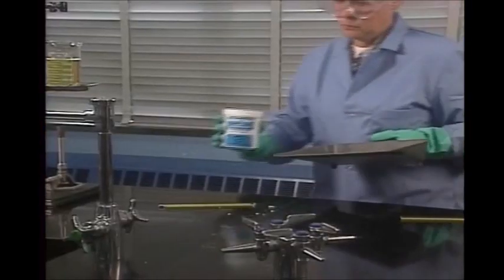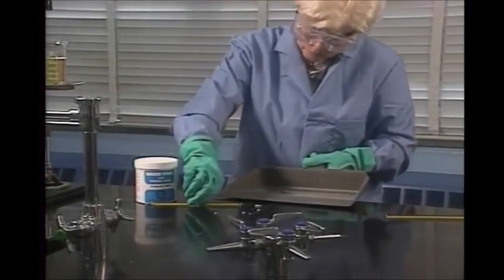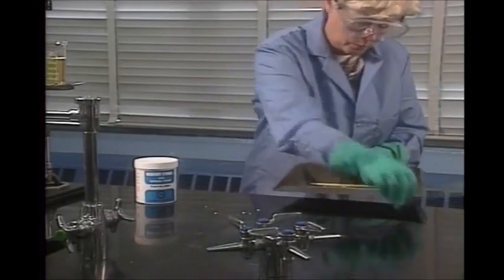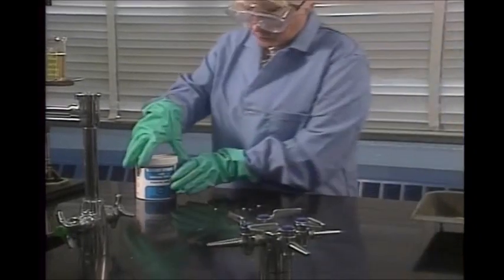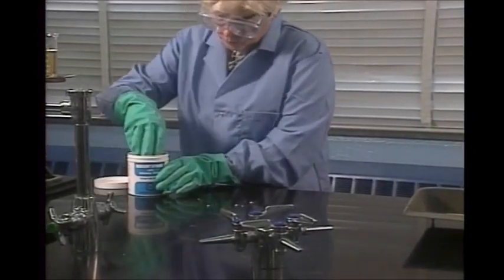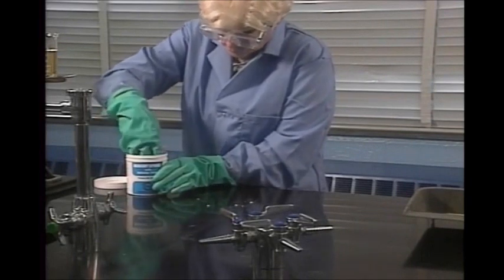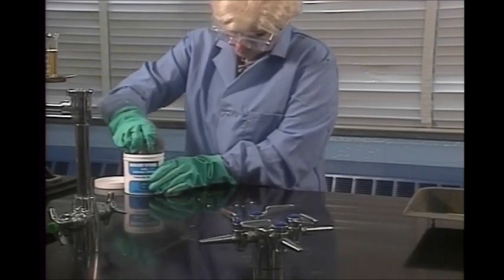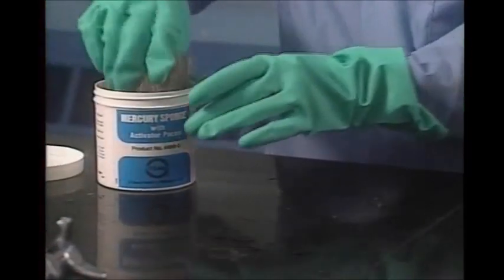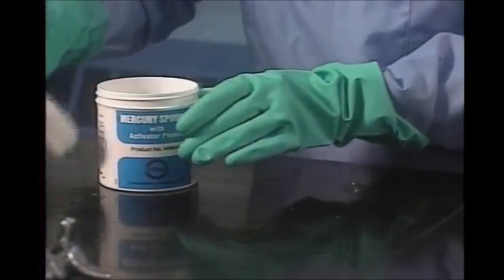Cleaning up a broken mercury thermometer is more difficult and also a job for your teacher. Mercury is poisonous and it won't soak into a paper towel. Mercury vapors also can escape into the air. If you work with mercury thermometers, your lab may be equipped with a mercury cleanup kit or sponge.